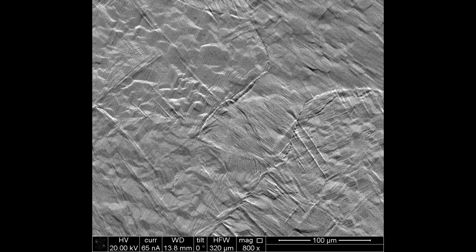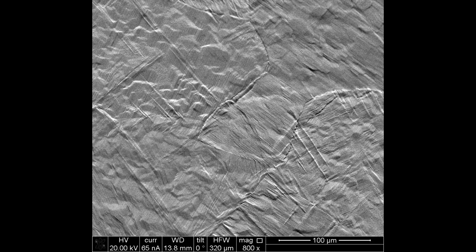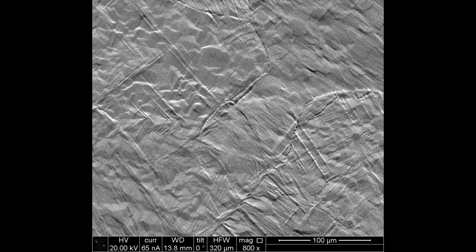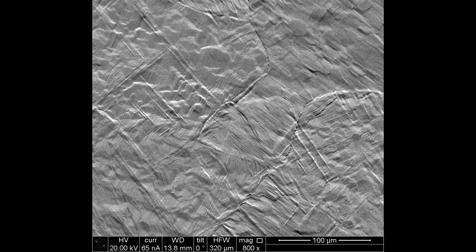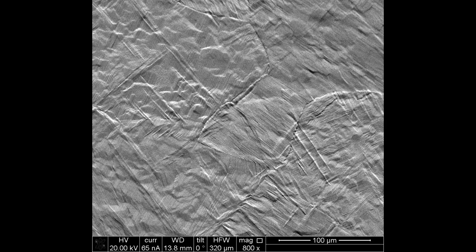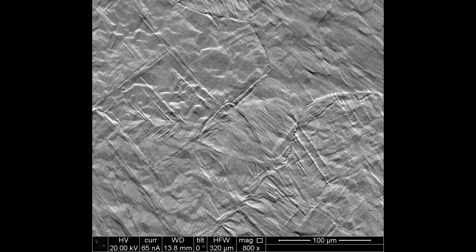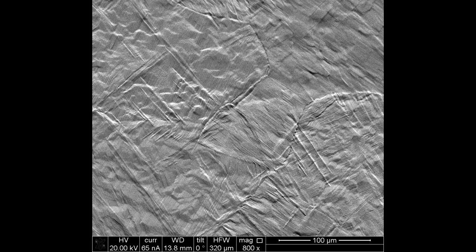To summarize, the alpha nucleation in Ti-6-4 appears to follow a similar pattern. First, individual alpha laths form at the beta grain boundaries. It is not clear whether these laths require an alpha allotriomorph to nucleate. Then nucleation continues as widely spaced alpha laths appear to form along all of the beta grain boundaries. This appears to occur by autocatalytic nucleation. These widely spaced laths impinge on each other from opposite sides of the beta grains, forming the skeletons of the single variant colonies.